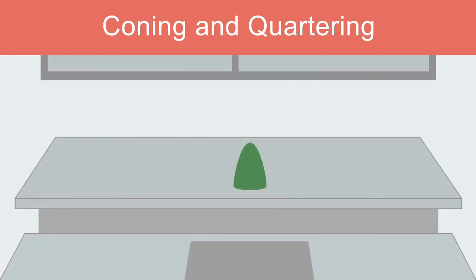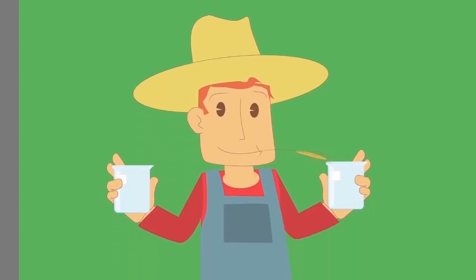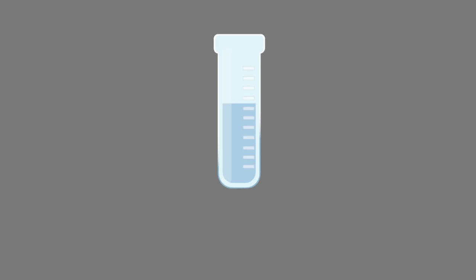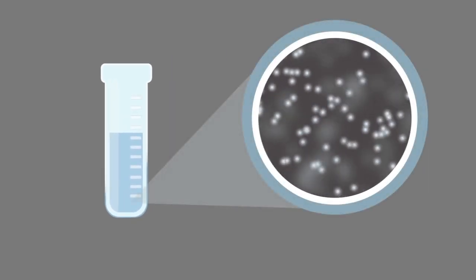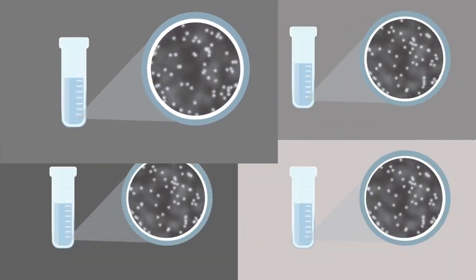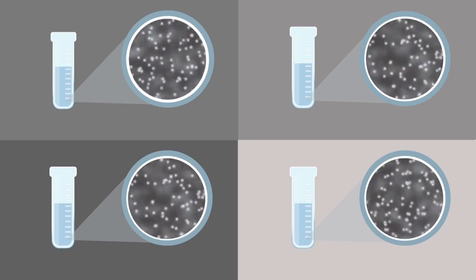The laboratory sample and individual test samples taken from the field are then prepared by dissolving the sample in water. Now the farmer has a laboratory sample. Small test portions called aliquots of the laboratory samples are used for individual analyses. From these analyses, the representative amount of nutrients are known, and the farmer can compare these with the individual samples taken from different parts of the same field. This confirms that the nutrients from fertilizers have been spread evenly through the field.